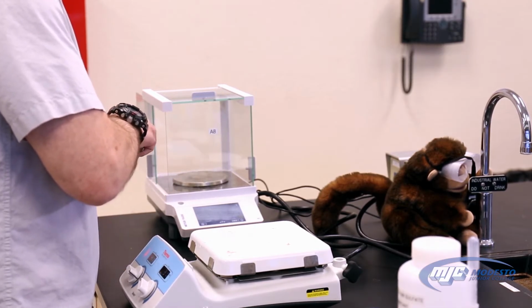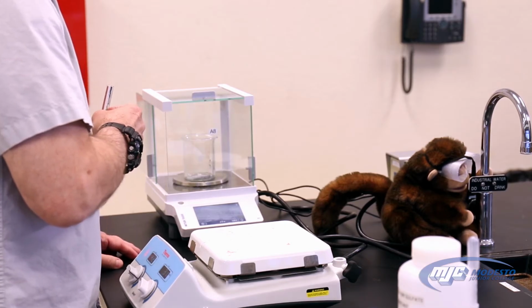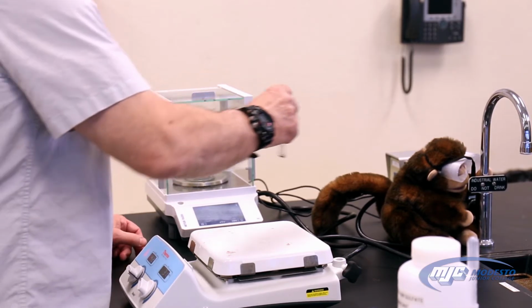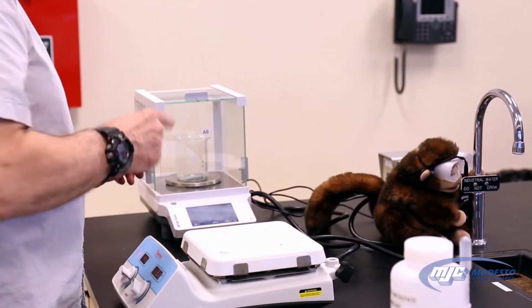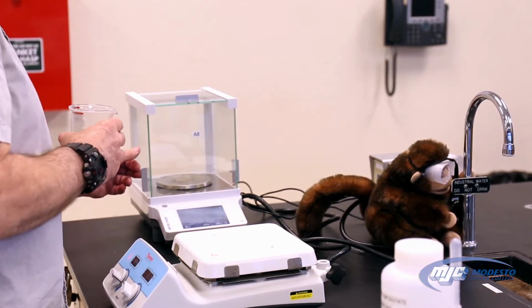Just a little more. There we go, just under 2 grams. That'll work. Write that number in our data table. That's the mass of the solid unknown, which we'll need.